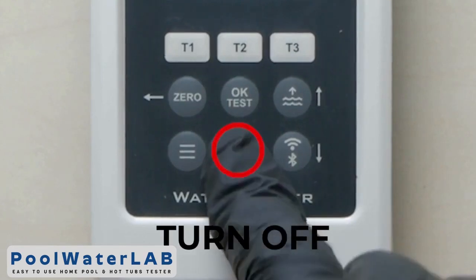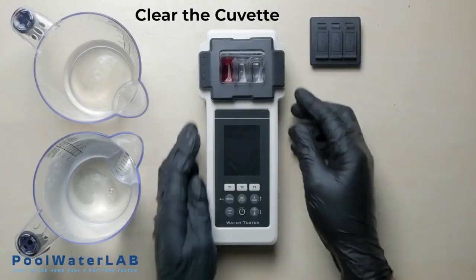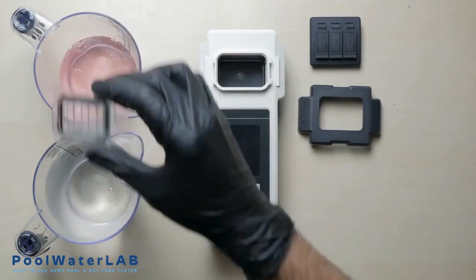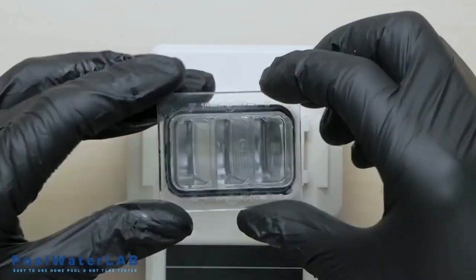Turn off the device by pressing and holding the off button. Run the other test if necessary. After completing the test, obligatorily rinse the cuvette with clean water. Wipe the cuvette dry with a clean cloth and prepare your tester for the next measurement.